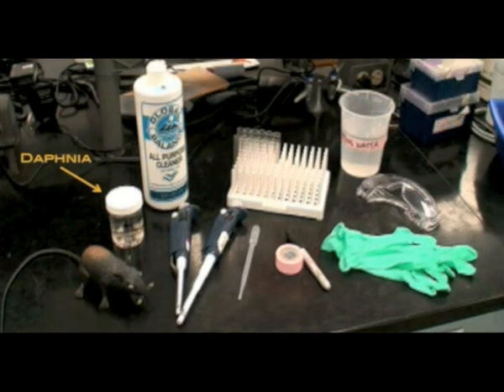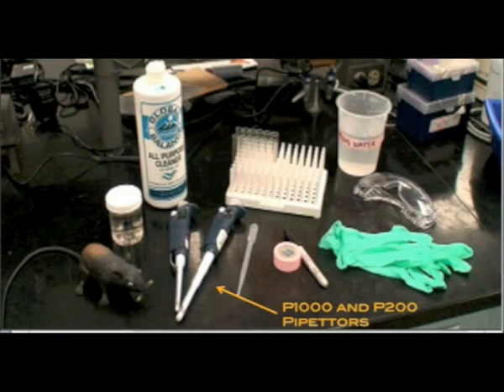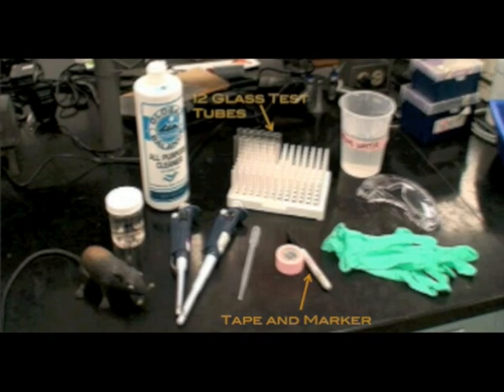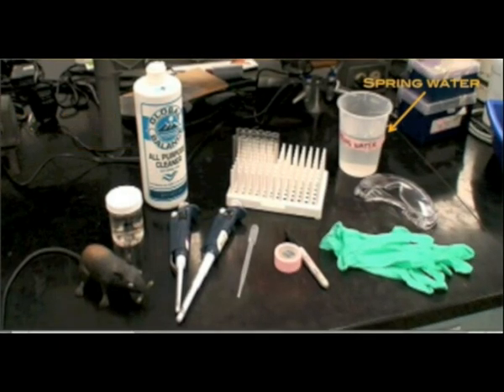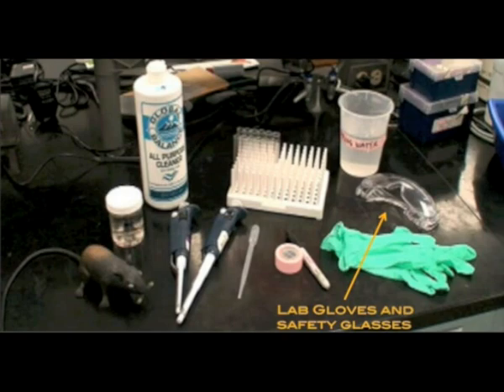To begin this experiment you will need Daphnia, P1000 and P200 pipetters, a transfer pipette, tape and marker, 12 glass test tubes, a household chemical, spring water, and lab gloves and safety glasses.